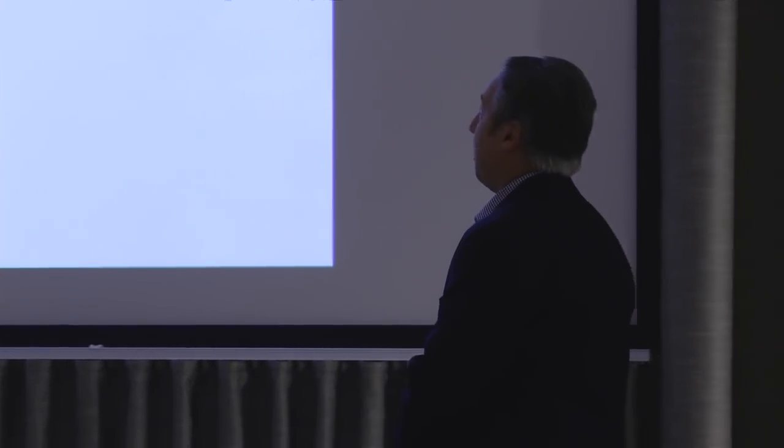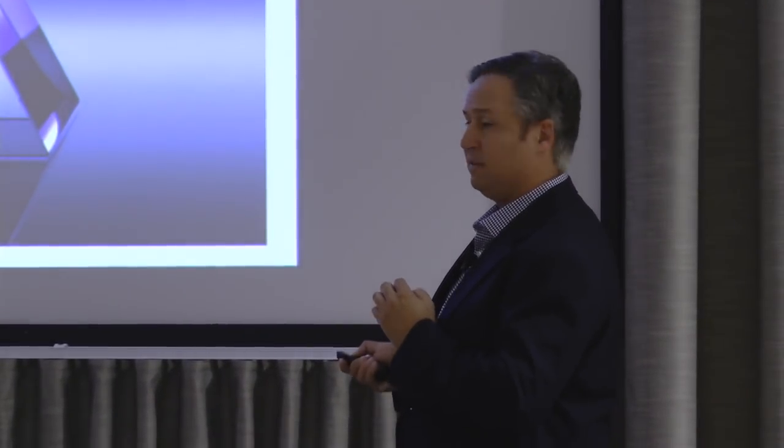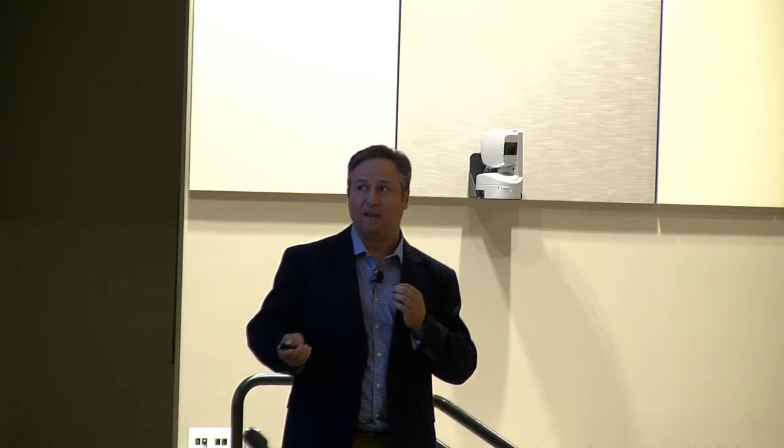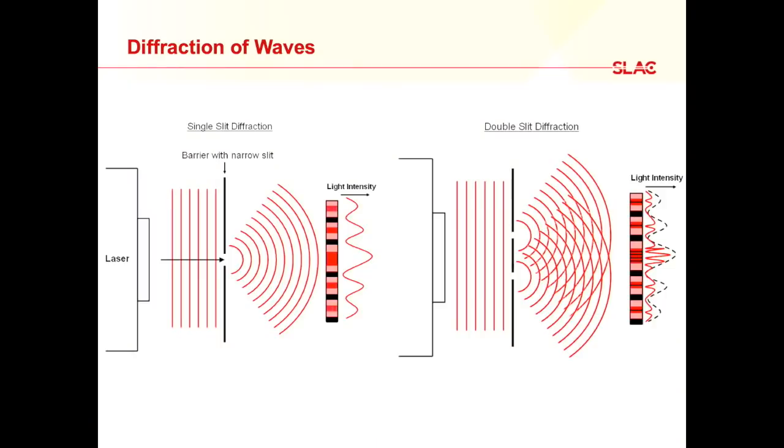So I'm talking about this here because we use the wave nature of light to study where the atoms are, but there's a consequence to that: the same light that interacts with the sample also causes damage, and we have to worry about that when we do our measurement. We want to use the good properties of light to study the nature of the material without destroying what we're trying to measure. So this theme will come back again a little bit later.